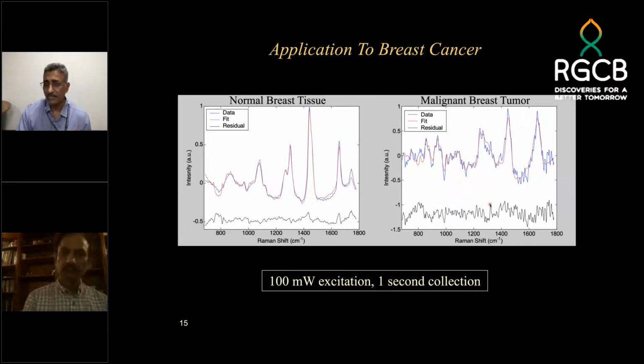And you know that sometimes the breast cancer doesn't spread too much, so you could control it very easily by not removing the complete breast. And this is one example. You have skin cancer, you have oral cancer because of tobacco chewing, various other things. If we can do this, this becomes a very, very important tool rather than removing the complete tissues and disfiguring a person. So this is something which can be done very easily. And by the way, you can detect it at a very, very early stage, because the Raman can detect at the epithelial level, so even before the tissue is building up, you can see the occurrence of tumor, and that's why this becomes useful.